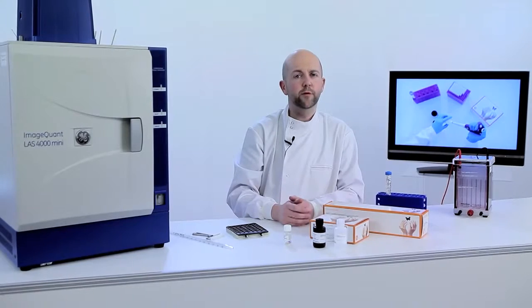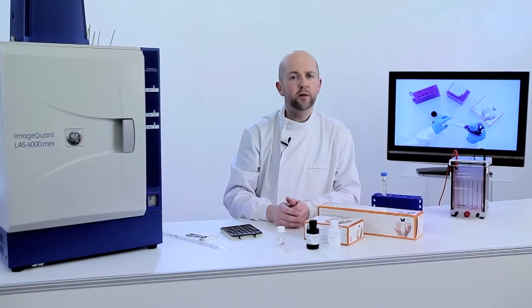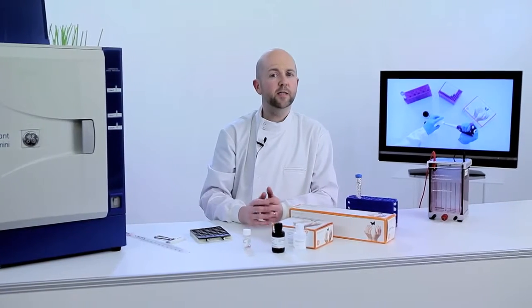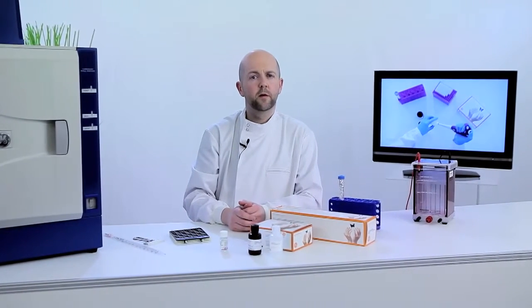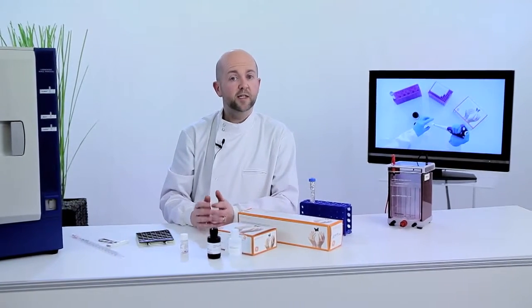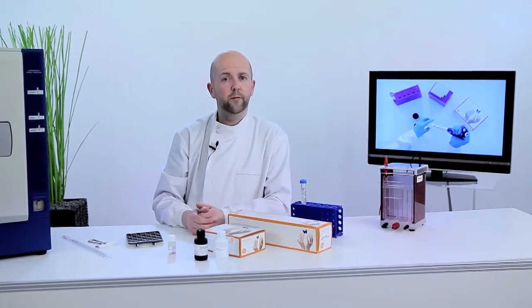X-ray film can be used, but a CCD imager with high sensitivity and broad dynamic range is a better choice for detection. There is no time pressure. The reaction is instant and the signal will last for hours.